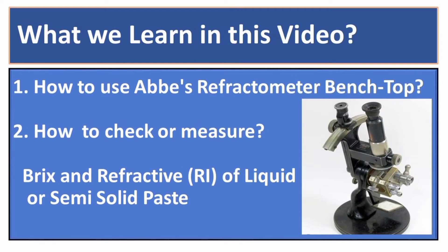Hello, hope you are doing well and safe. In this video, we will learn how to use the Abbe Refractometer Benchtop, and number two is how to check or measure the brix and refractive index of liquid or semi-solid paste.